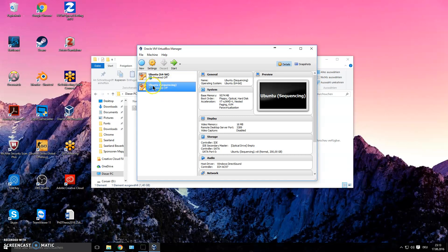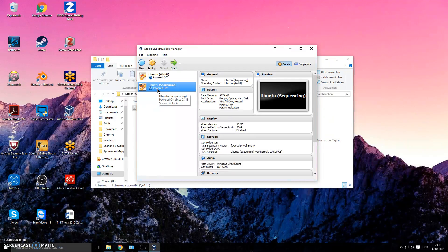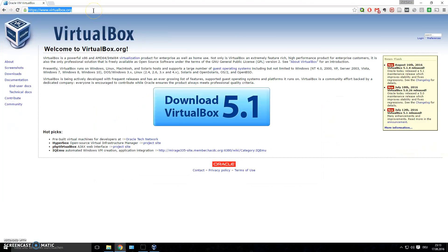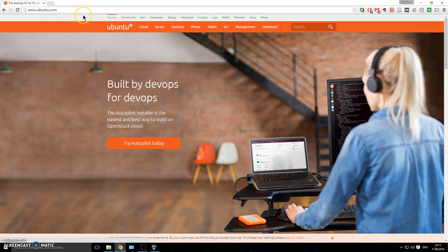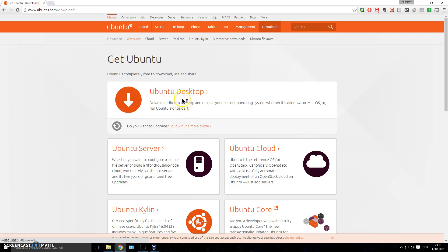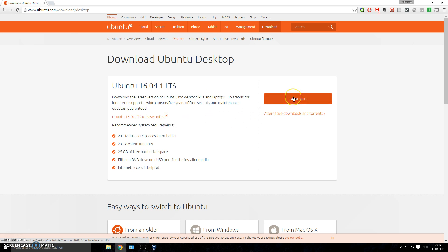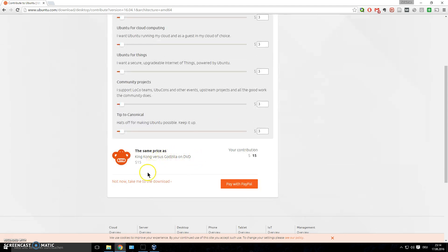Now the new 'Ubuntu Sequencing' computer appears in your VirtualBox Manager. You can power it on, but Ubuntu isn't installed yet — you need to download it and feed it to the machine like inserting a CD. Go to ubuntu.com — make sure you click the correct link — and click Download. Choose the Ubuntu Desktop distribution and click Download.